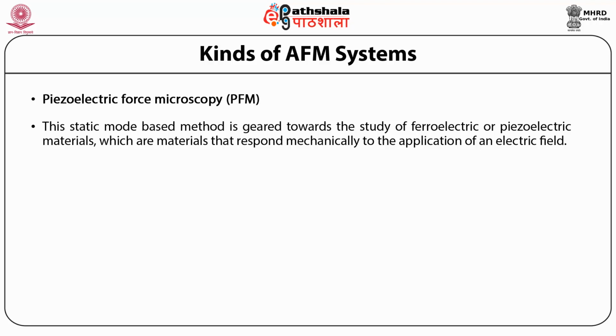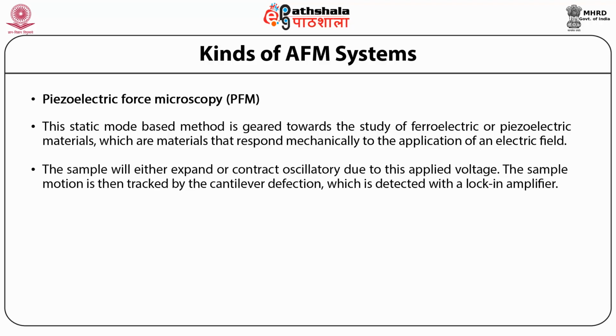A sharp conductive AFM tip is brought into contact with the sample and an AC voltage is applied between the tip and sample. The sample will either expand or contract oscillatory due to this applied voltage. The sample motion is then tracked by the cantilever deflection, which is detected with a lock-in amplifier. The amplitude gives information on the piezoelectric tensor of the material, and the phase provides information on the polarization direction.